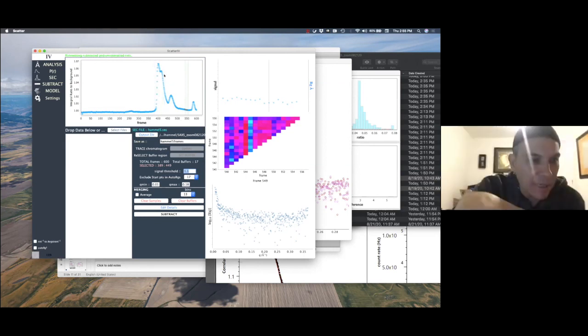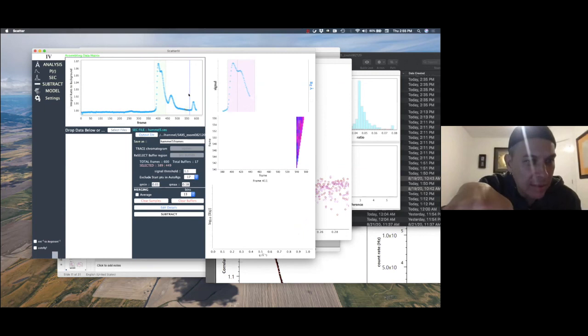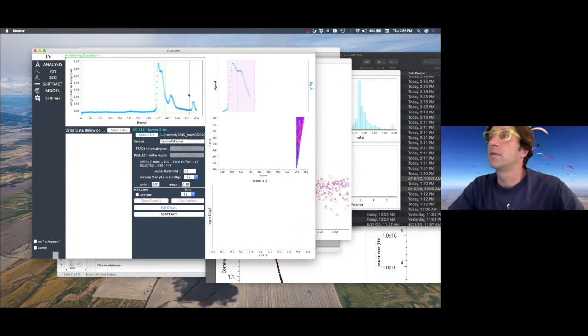How long is the run? Is that 30 minutes or is that an hour or something? It's 25 minutes, yeah. 25 minutes. Yeah.